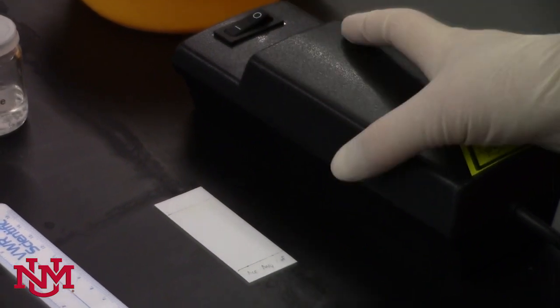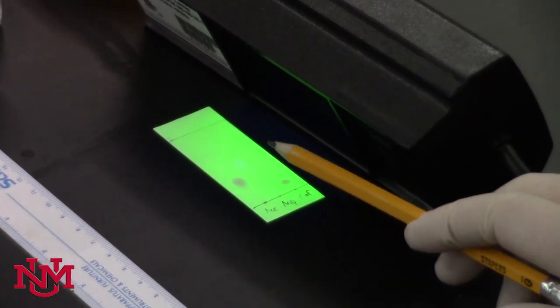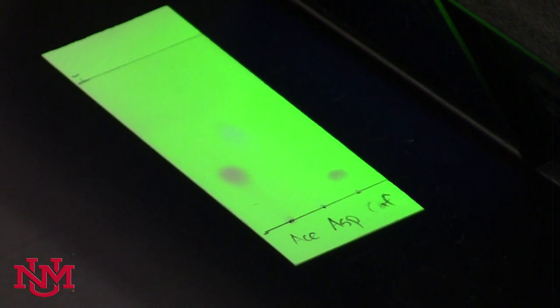Turn on the UV lamp and hold it so that it's above your TLC plate. You should see dark spots corresponding with the components that have moved up various distances up the plate.